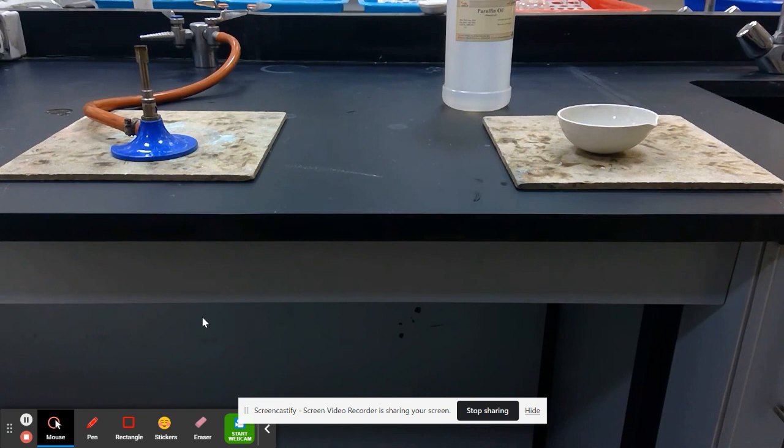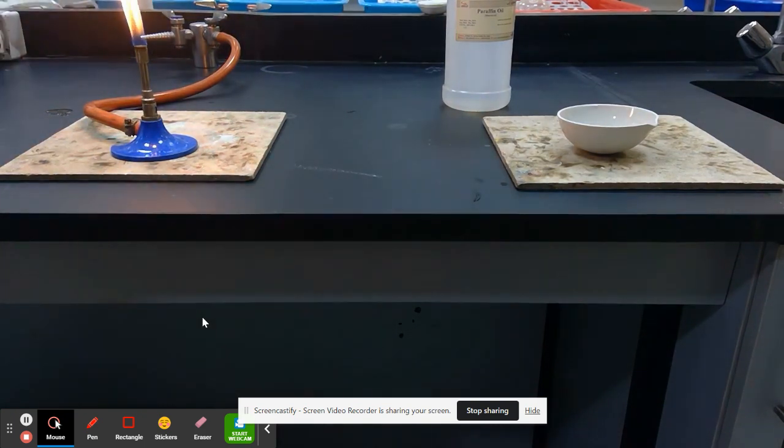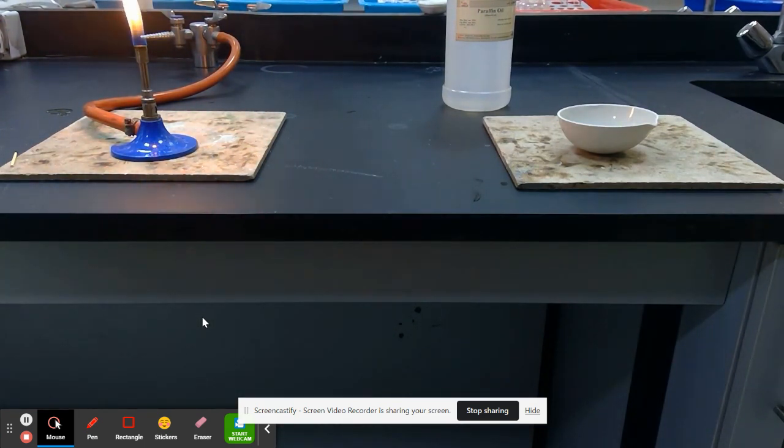And the final property that we need to know is to do with flammability. So let's test their flammability. As we're aware, the gas from our gas taps is very flammable. It sets fire very, very quickly and easily. So high flammability for our low number of carbons, our small carbon chains.